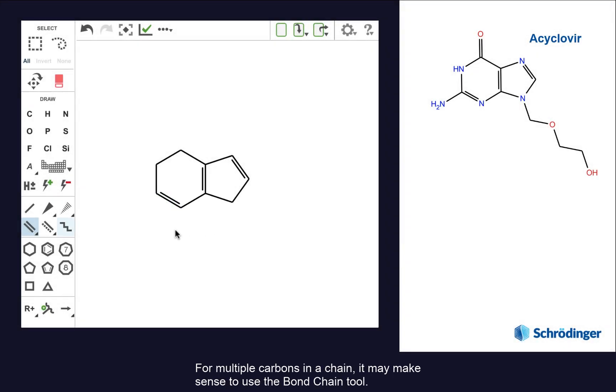For multiple carbons in a chain, it may make sense to use the bond chain tool. With 5 bonds here, drag until you see a 5 and then release the mouse.